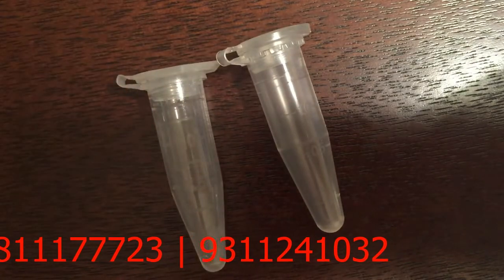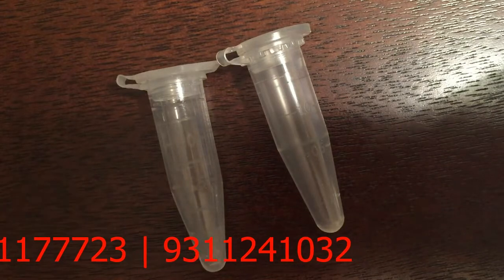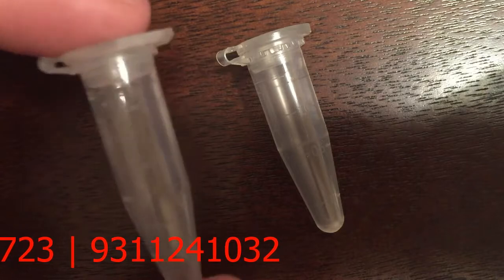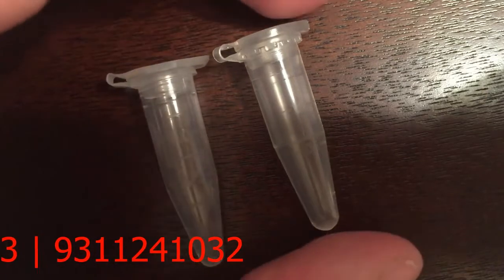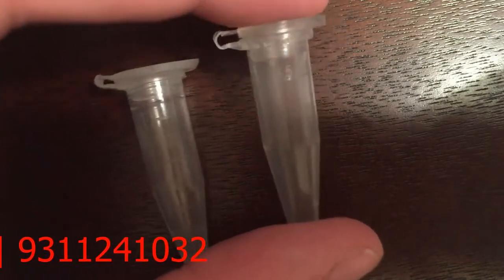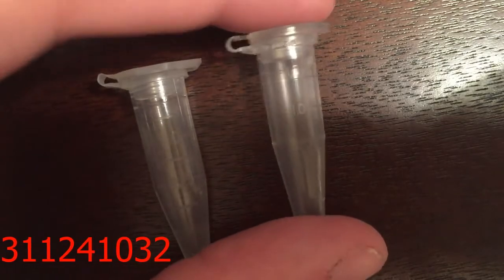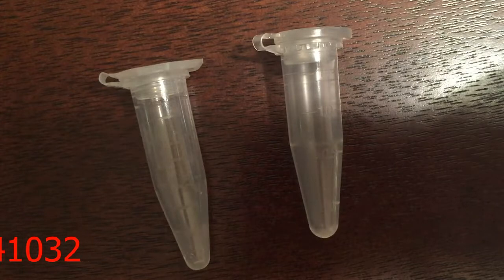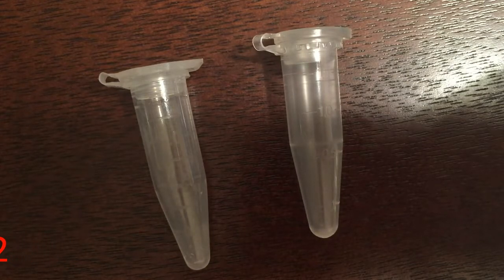Furthermore, if you have applications that require boiling or autoclaving of a volume at 1.5 milliliters, you might have some spillover if it's put in the 1.5 milliliter tube. The Brandtek tube has some extra room for those applications. Really, if you were wanting to use a volume of 1.5 milliliters or approaching that, I'd suggest purchasing a 2.0 milliliter tube.